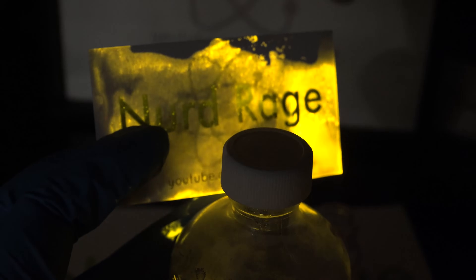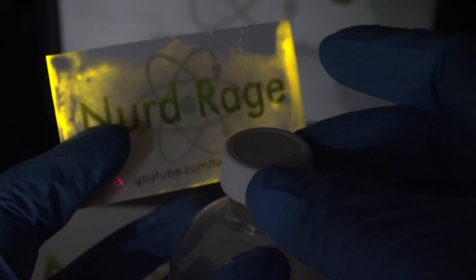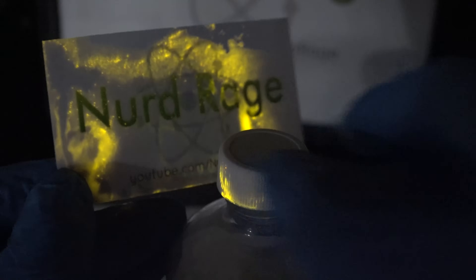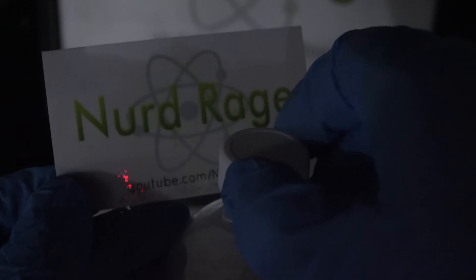Whoa! I just cracked open the bottle and the burst of oxal chloride vapor activated the glow. Interestingly, the solution is on my gloves and I'm coloring everything I touch. It's amazingly beautiful — the waves of brightness that wash over the card since the cloud of vapor isn't uniform.